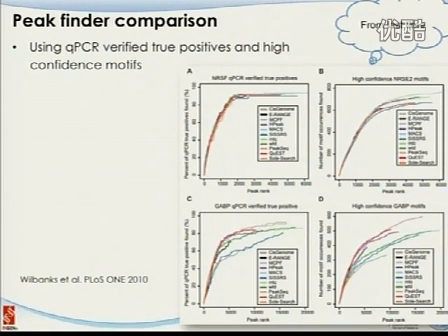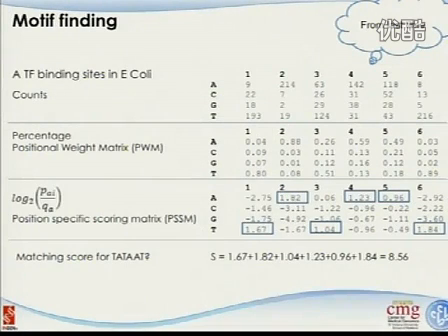This is one paper published last year trying to evaluate the different approaches. I'm not going to go into detail on the evaluation results, but keep in mind that at the time you select the algorithm to use, you don't have to write your own program, but when you pick, go back to the paper to see which one fits your strategy.